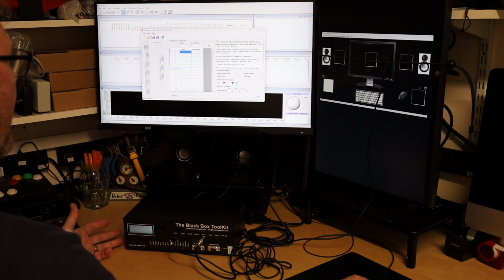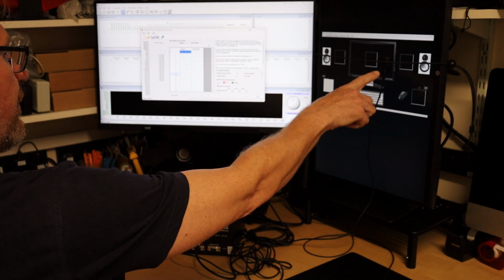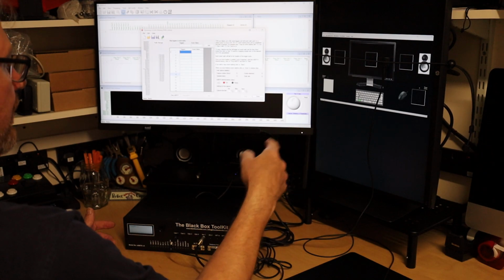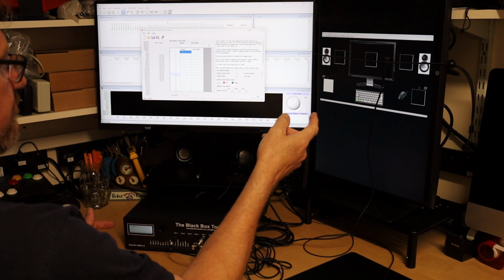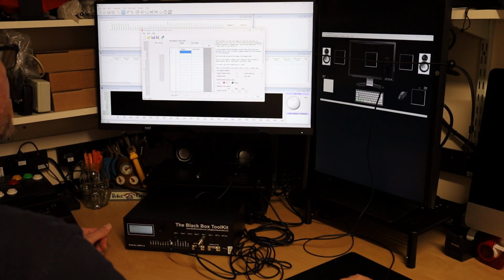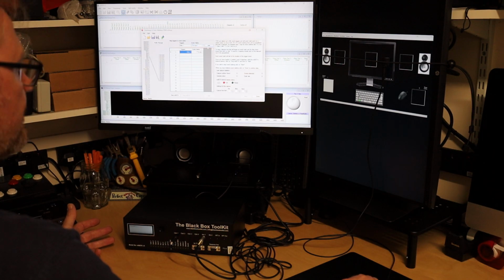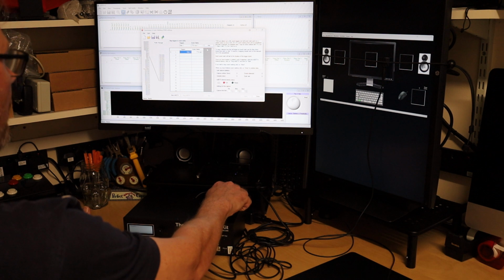So this is how you pair inputs and outputs. So in other words, how you pair the visual stimulus image opto-detector to a TTL out that goes into your EEG digital input, or your eye tracker digital input. So basically what we do is we look for a trigger, and we can say, okay, the trigger's opto 1, and we're going to event mark it on rear out 1. So that's on the 25 way on the out port.